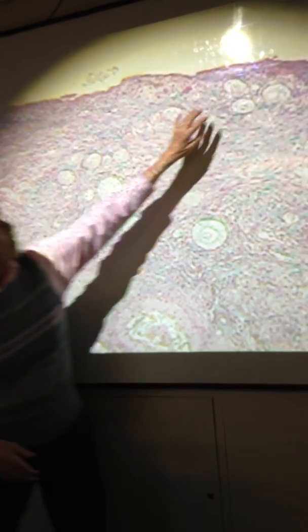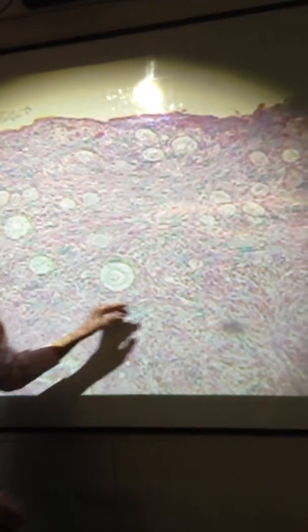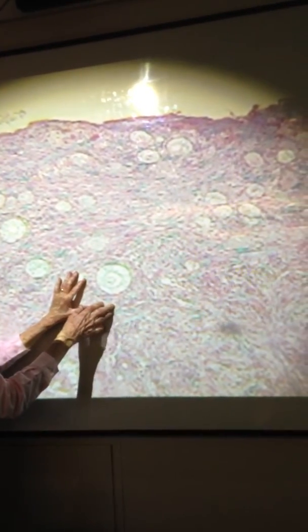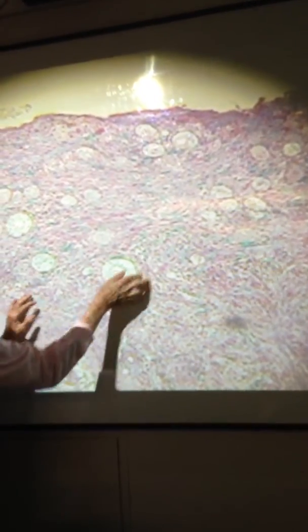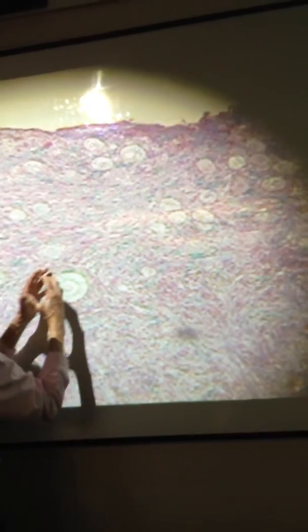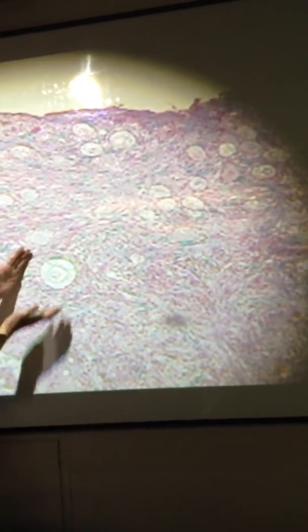So here we're running across some primary. So the primordial out against the border of the ovary, egg nest. These are, if you see through the scope, these are nice primary follicles. There's granulosa cells, but there's no fluid around them. So obviously larger than the primordial follicles, the oocyte has grown in size, and there's granulosa cells around it, forming a primary. It's just not showing up near as well here as it is on my slide.